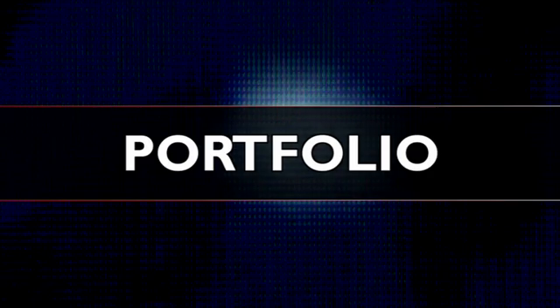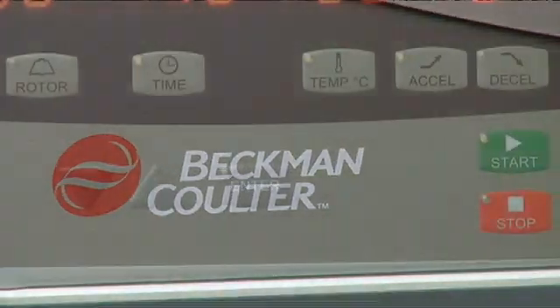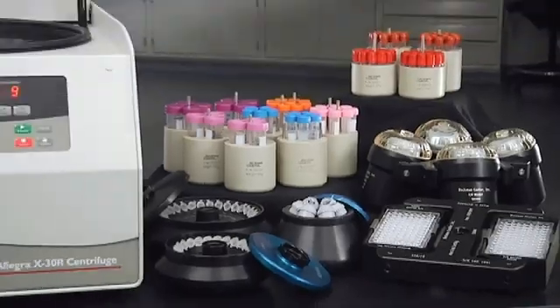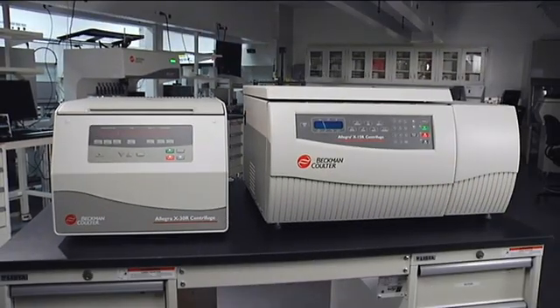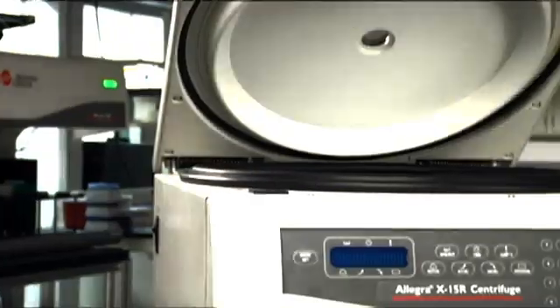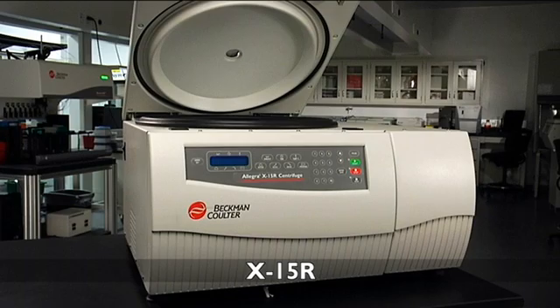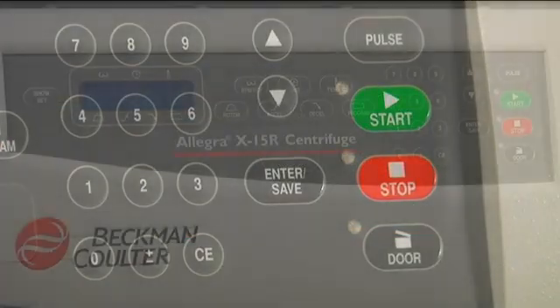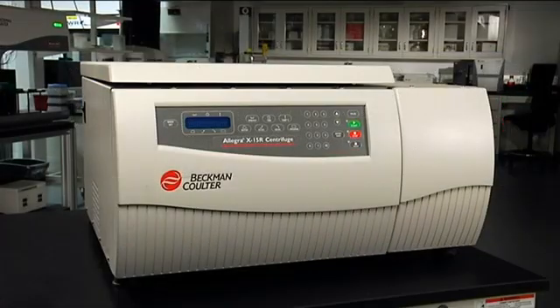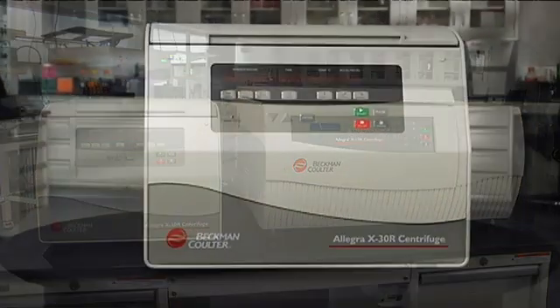The Allegra X30 is a complementary addition to a strong Beckman Coulter centrifuge portfolio. Whatever your centrifuge need, we have the equipment and application packages to meet — even exceed — your expectations. In addition to the X30 Series, we offer the X15R, Beckman Coulter's best choice for customers who need more, with the largest capacity, premium swinging bucket performance with application flexibility, and a powerful refrigeration system. Whatever your lab needs, Beckman Coulter can help, and you can count on our commitment to quality and service throughout the sale and beyond.